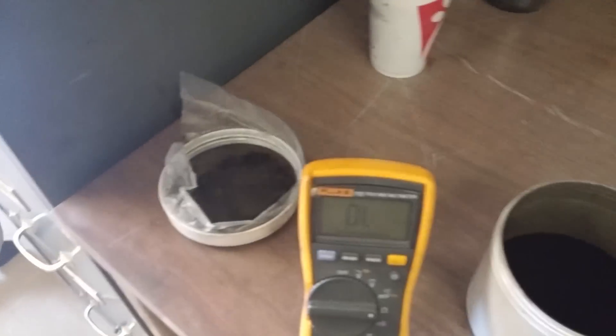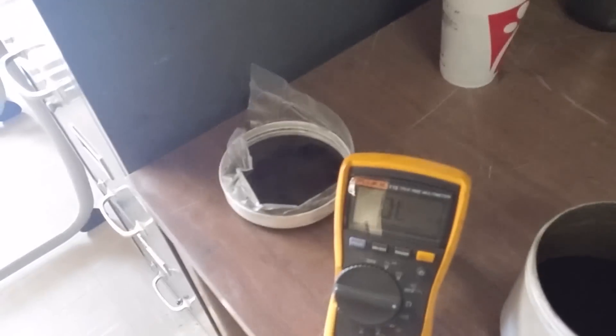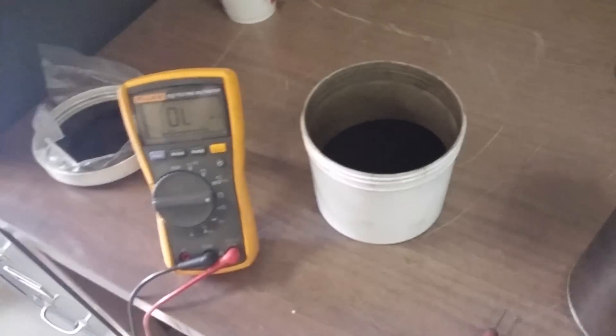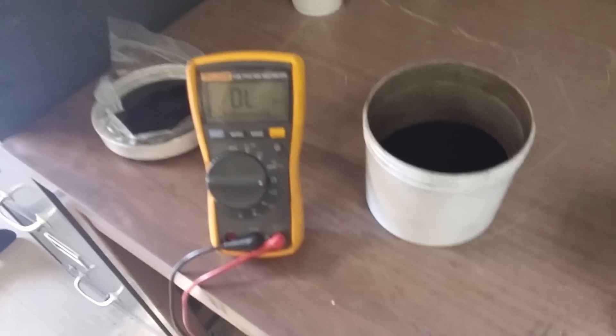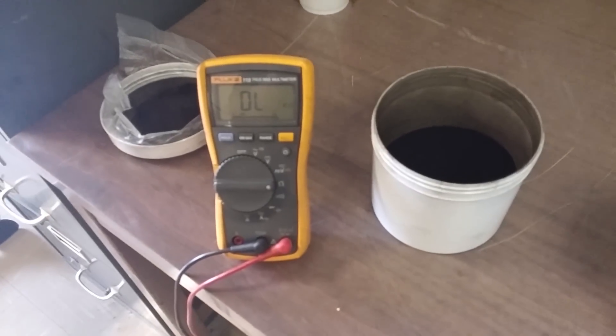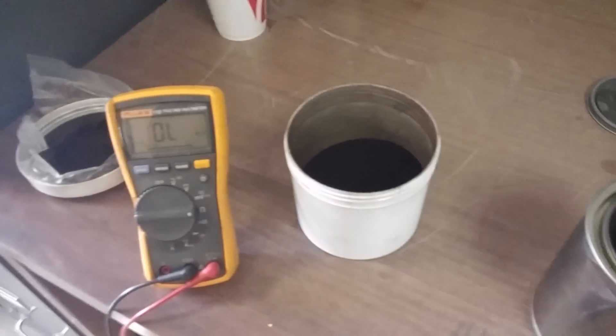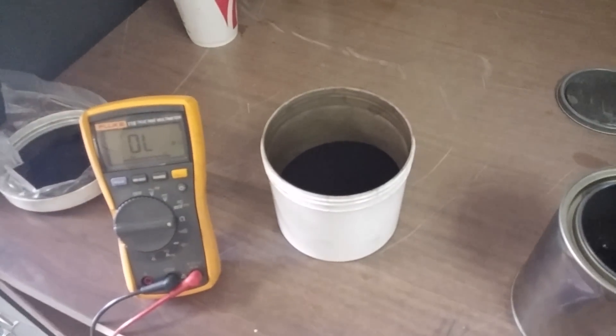If you do it to graphite, you're going to get about 200 ohms of resistance. Same simple test, just dunking it in there. It's very neat.